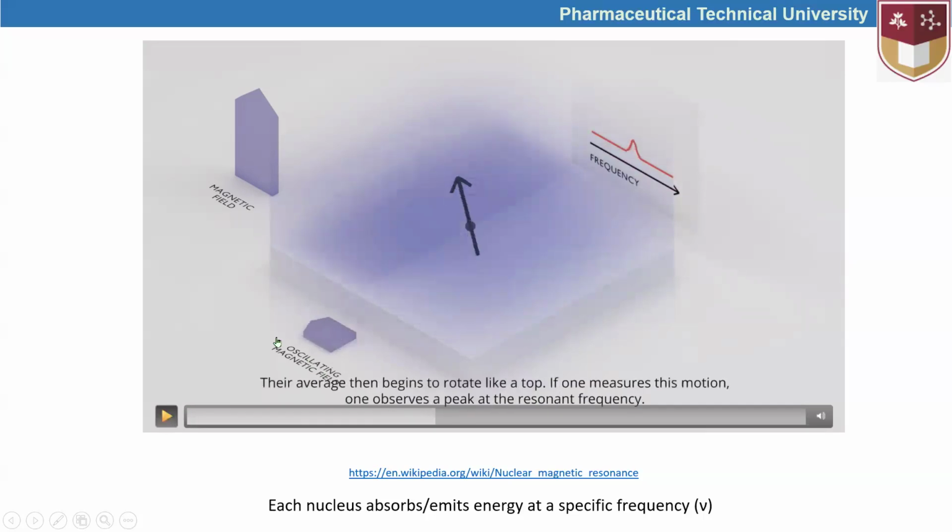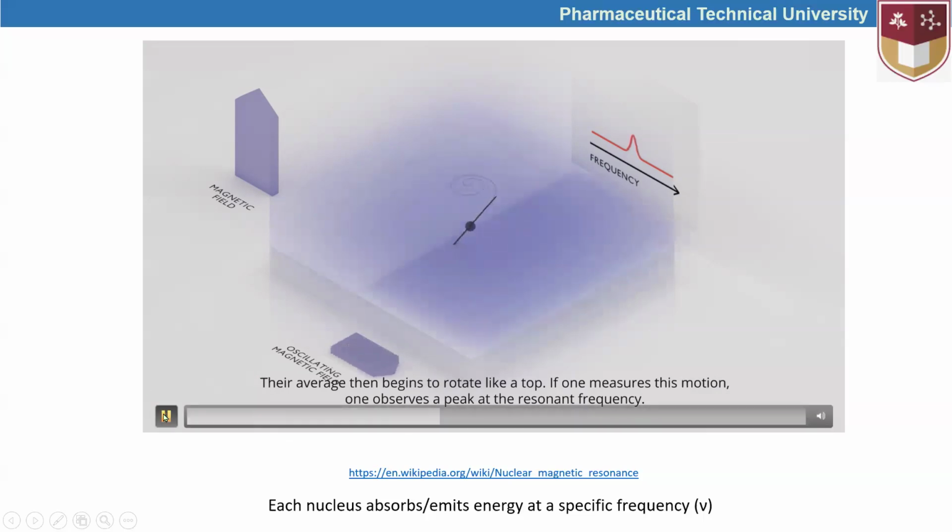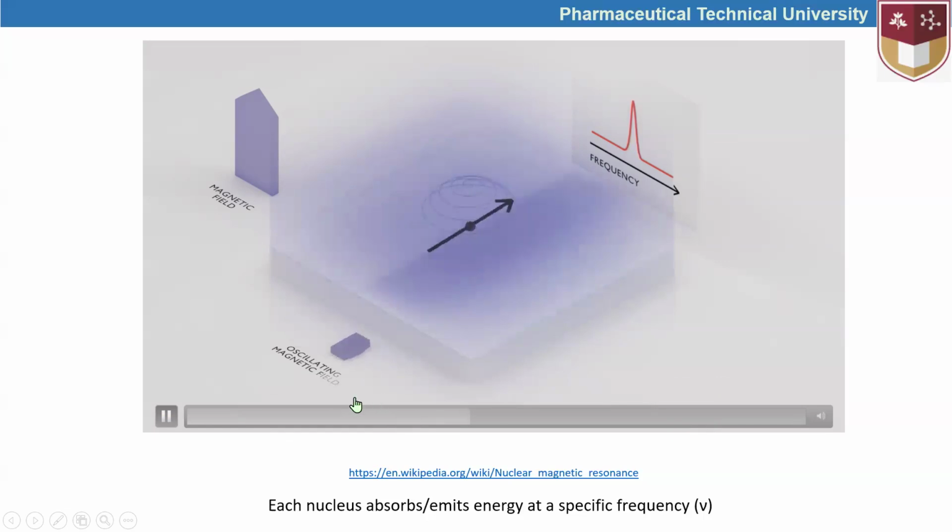So here, under the changing magnetic field, switch on and off conditions, those atoms being studied, hydrogen, for example, have their own, let's say, resonance, and those resonances are turned into the signals as indicated here. It has this kind of changing action under the oscillating magnetic field here.